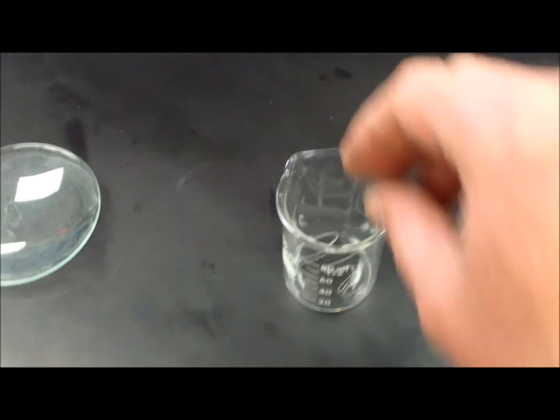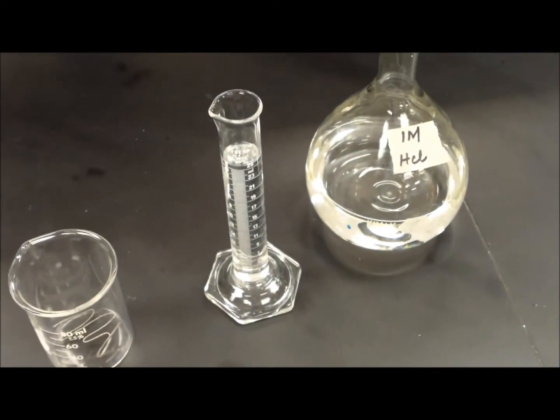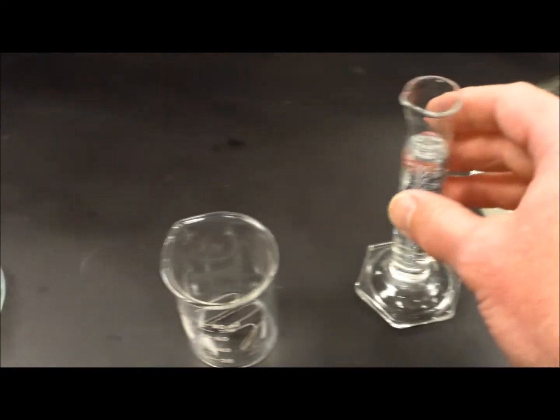For the next step of the experiment, I'll put the magnesium ribbon into the beaker and I'm going to add 25 milliliters of that one molar hydrochloric acid.